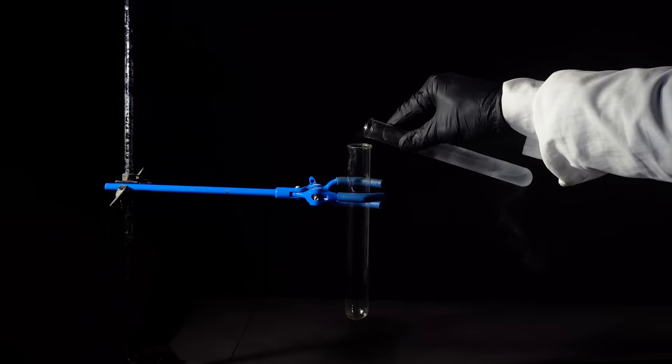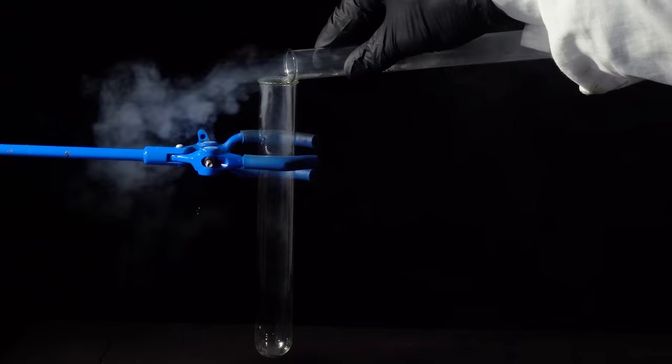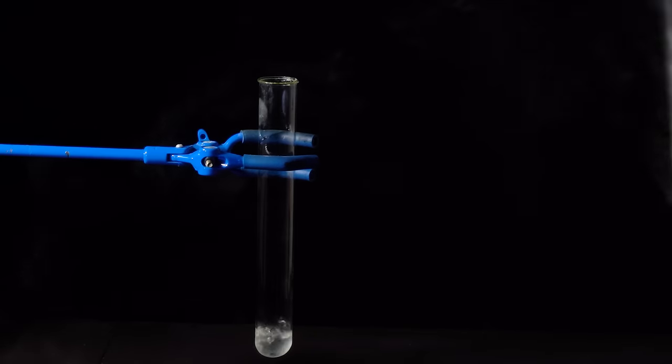Now I will leave a watch glass on the test tube for half a minute and then ignite the mixture.